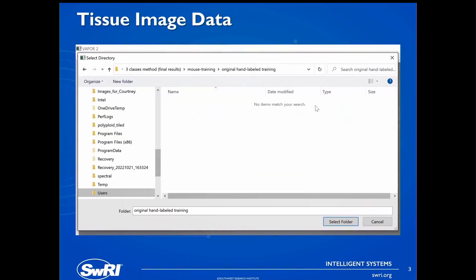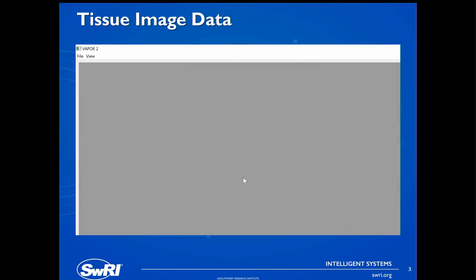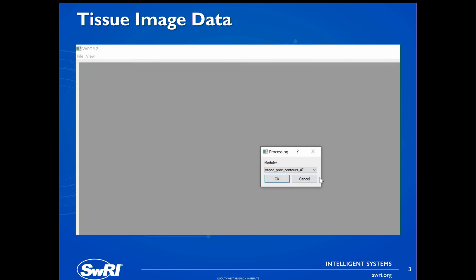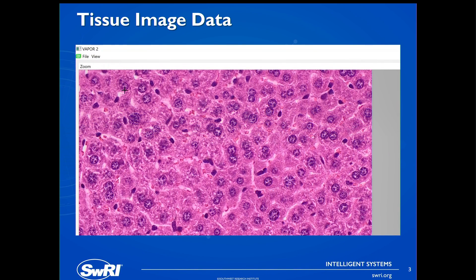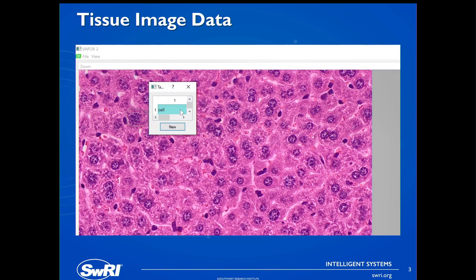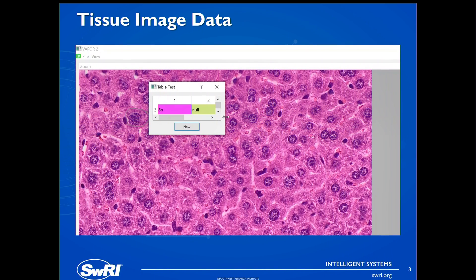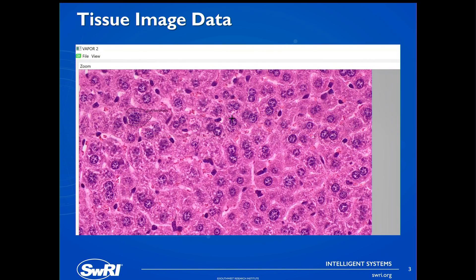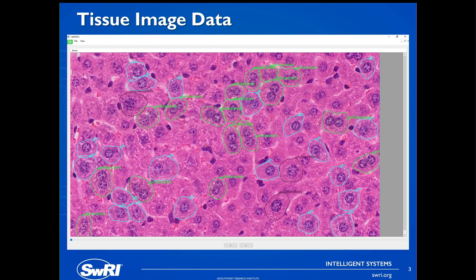Here's a video using a GUI we created in PyQT, where the user loads in some images. We have created a number of different processing modules, but here they used contours, because we'd like to outline the outside of every cell when labeling the training data. I show three different types of cells, and once the user is done labeling all of the training data, it'll look something like this. We used 30 images similar to this to train our algorithm.